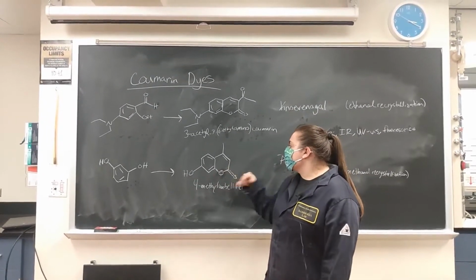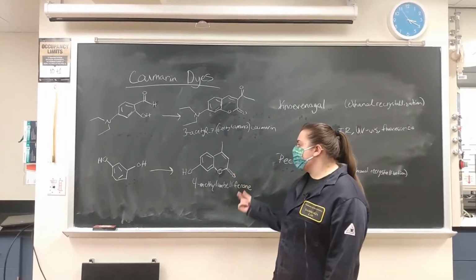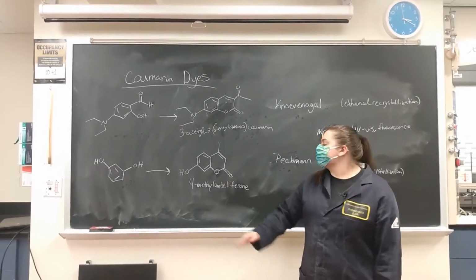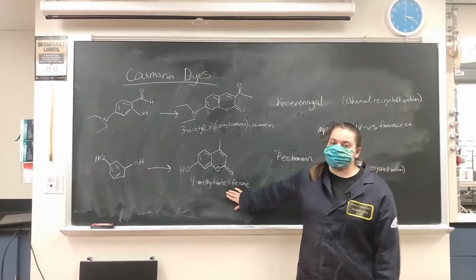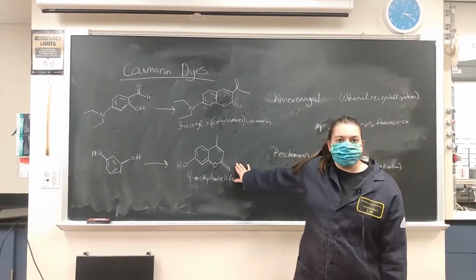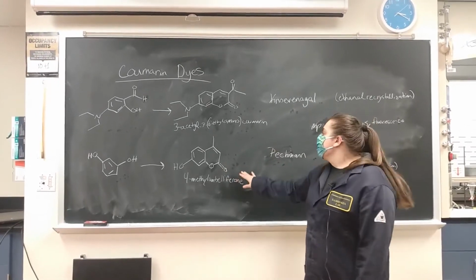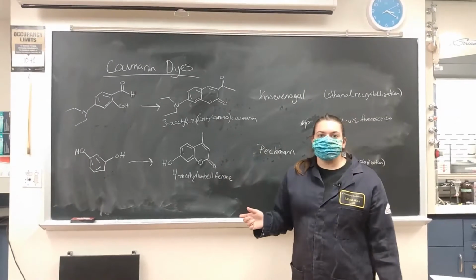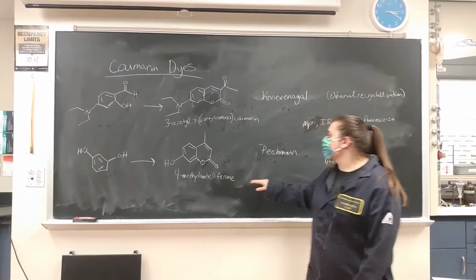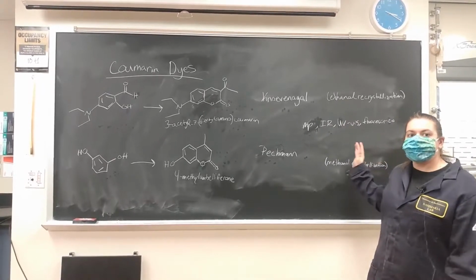Then we're going to acidify it more to protonate it, which is then going to undergo an electrophilic aromatic substitution to form our final product here. Once we have these two final products, this one is going to be purified by recrystallization again, but with methanol. With our final products, we're going to be doing a bunch of different analysis on them. So we're going to be taking a melting point, IR, UV vis, and fluorescence spectrum.